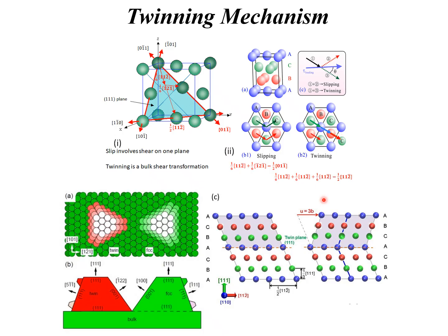Also in BCC crystals, the lattice is distorted except for a few planes which are basically recognizable as the same planes before and after the shear. And in those cases, the material has to shuffle to reform behind what would be called the second undistorted plane. Now, I just realized I should have maybe put something about that in here, but that's a different lecture, so I'll leave that alone for now.